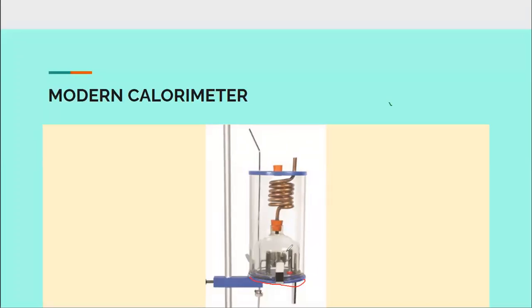Another thing, there is a chamber inside, and in this closed chamber, the food is burned, which ensures that the food is completely burned. The food is not exposed in the air for the heat loss or for the incomplete combustion. Then there is oxygen supply inside this chamber. So the oxygen supply means it will ensure that the food will be completely burned.